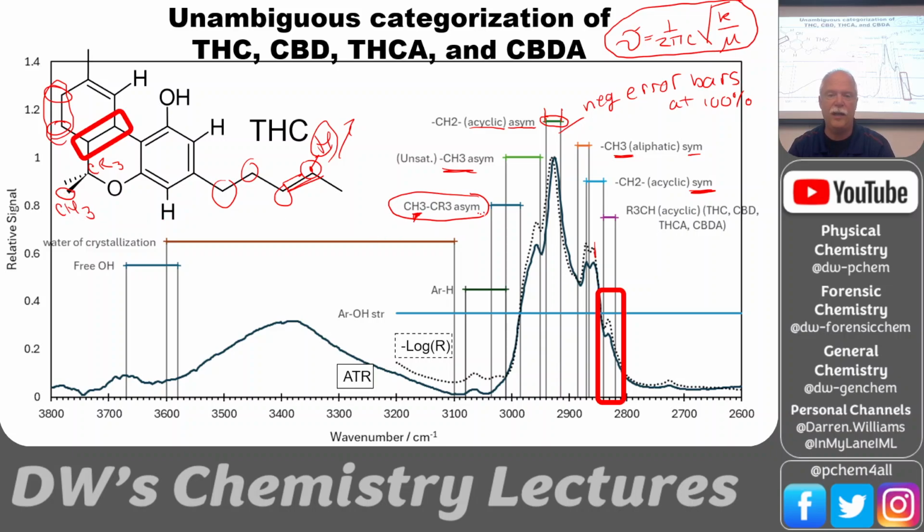So this methyl here, that's a particular characteristic group frequency. In the characteristic group frequencies book, you have all of these little scenarios of types of CH stretches. And one of them was this, that it's a methyl group bonded to a carbon that's got other things other than hydrogen on it, all 3 of its other valences. Okay.